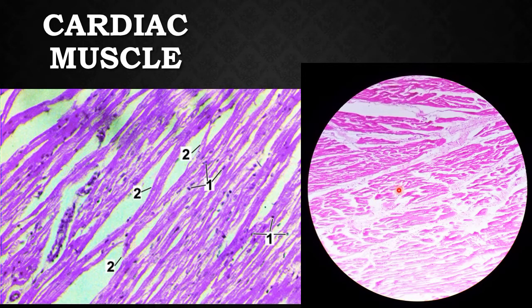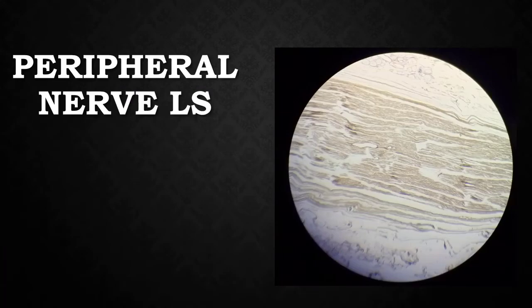Okay, these muscle fibers are branched. Here you can identify one branch. And you try to observe clearly. Every muscle fiber has a nucleus exactly at the center. Here you can see these are the nuclei, small dot-like structures. So centrally placed nuclei and branched muscle fibers. These are the identification points you also have to write in the spot.